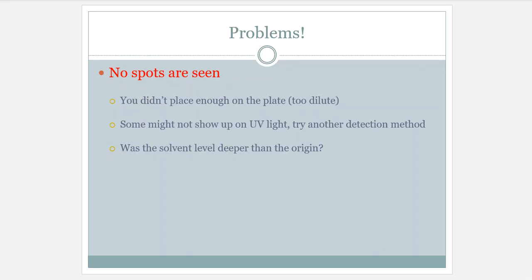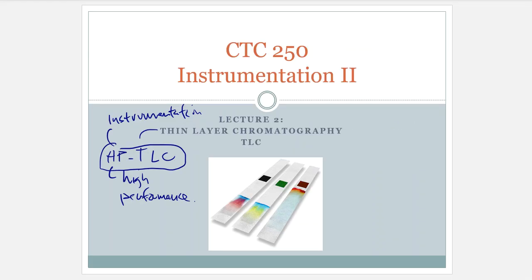All right, so folks, that's going to end our lecture on HPTLC and TLC. It includes the high-performance thin layer chromatography instrument. It also gives you a general overview of the proper ways that we should be developing plates and what we should be doing and what we should not be doing by hand, as well as a little bit of automation or instrumentation added to it.